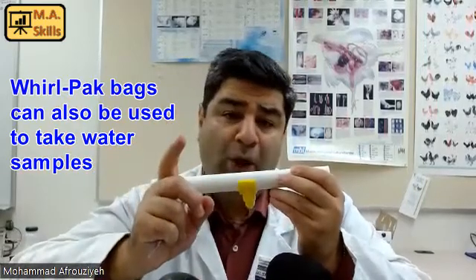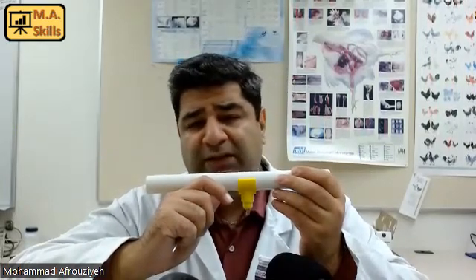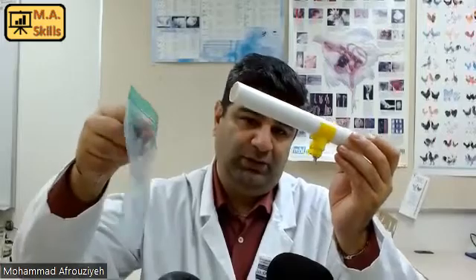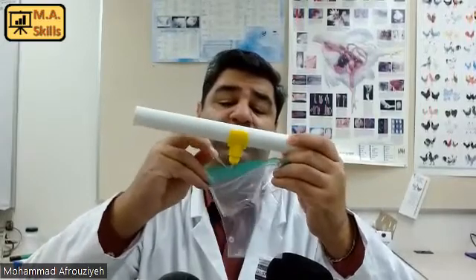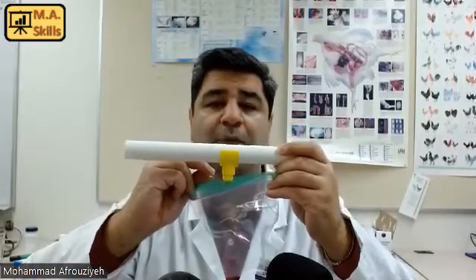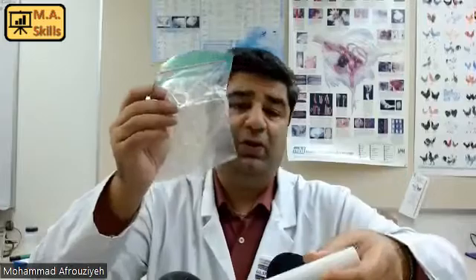We need to have a clean sample bag and label it with the barn number and the drinker number. For example, if you are running this water test on your third barn, barn number 3, and the drinker line number is 4, write that on your sampling bag. Then trigger the nipple drinker to collect the water sample inside the sampling bag, and hold it until you get the right amount of water.